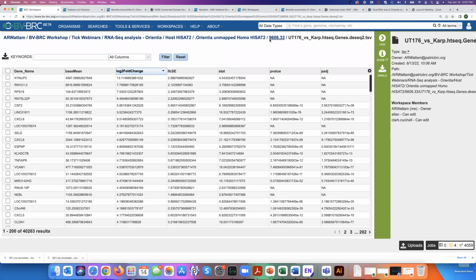One last thing. Yeah. A quick question, sorry, this is very nice, obviously. Can you do double sorting on 2 columns, or you'd have to download that to do in Excel? No, right now you would have to download it in Excel. This is new functionality, so it would be nice. In a lot of our other services, you can open a filter and filter on that, and so we could try to move for that.